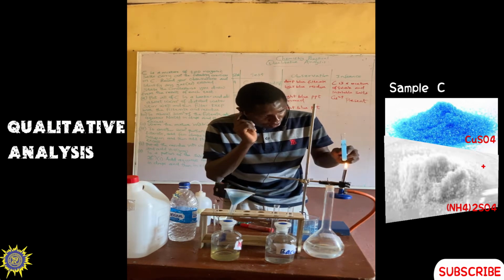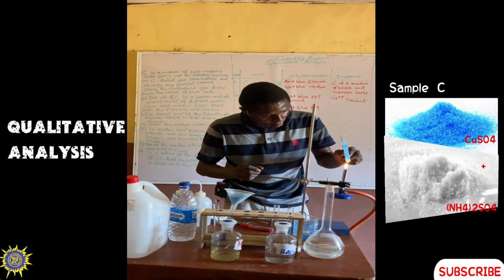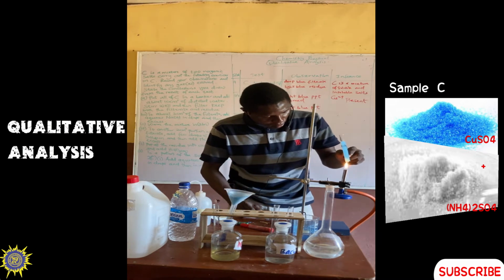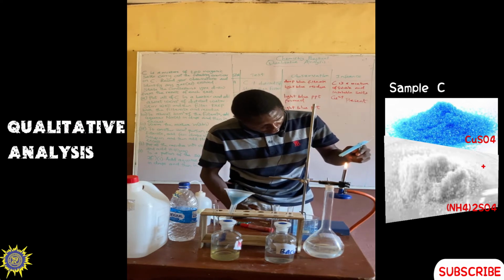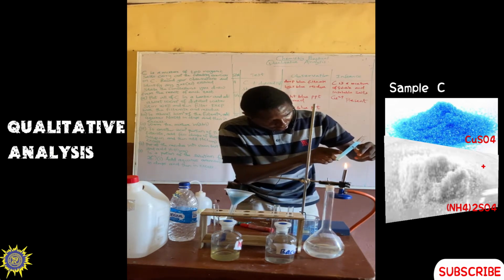And you can observe a sound. It's because I'm not putting it directly on the flame that it's not fast. You can see that the color is changing already.